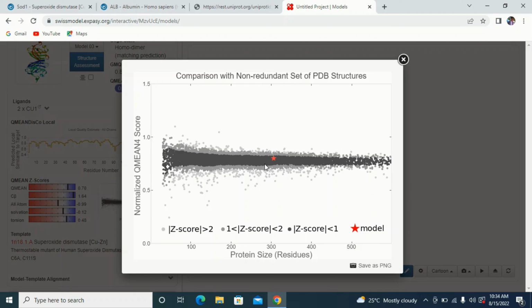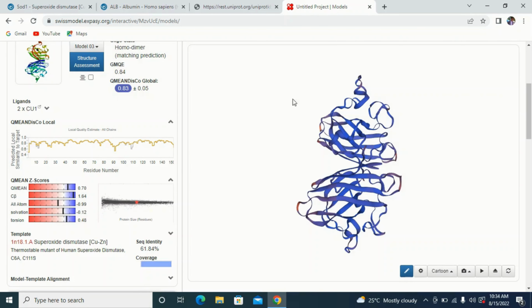Okay, so by this, if I click on this, I'm going to download this particular image and keep it for my write-up later. So I'll close this. Remember, this is for this particular first one. Then we have other information, so I can easily close this back.